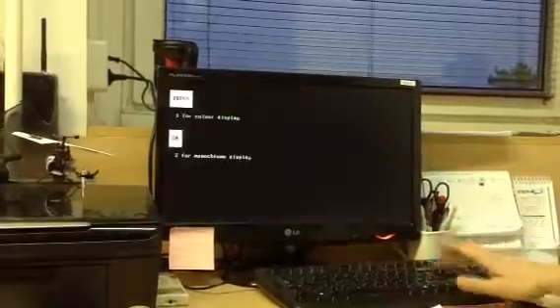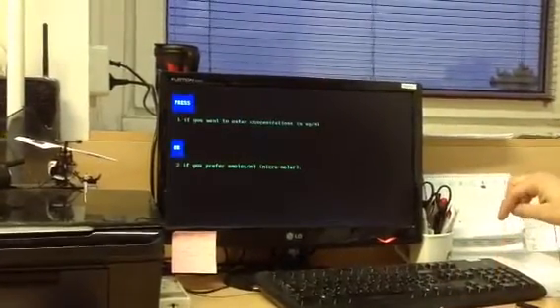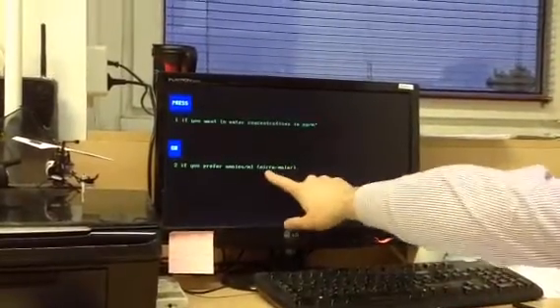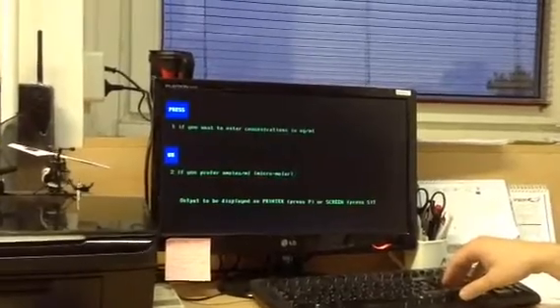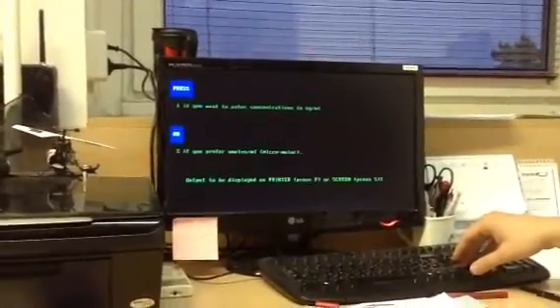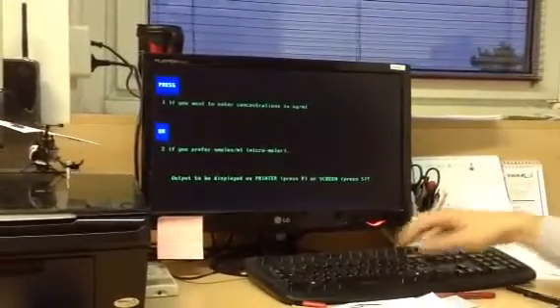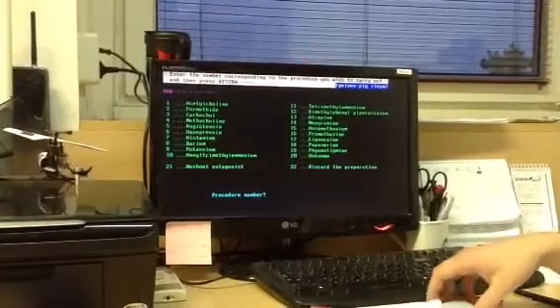Then you have to press 1 for the colors, and press 2 for micromolar. This is the way you have to add the concentration of each agent. Then you have to press screen S, and you will enter this good old screen.